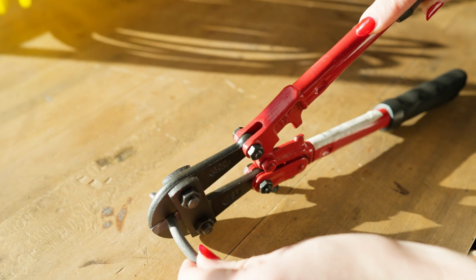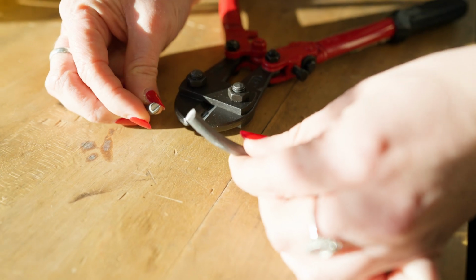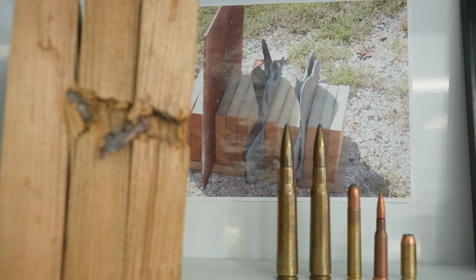Toolmark examination is the comparison of characteristics left behind when one object hits another object. The harder object strikes the softer object, leaving behind striated or impressed tool marks. A gun is considered a specialized tool in that aspect. When a firearm is manufactured, the machining process leaves behind unique characteristics on that firearm. Those unique characteristics become even more unique over time through use and wear of that particular firearm.